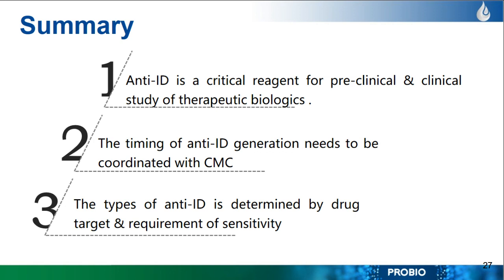To summarize, anti-idiotype is a critical reagent for preclinical and clinical studies for therapeutic biologics, and the timing of anti-idiotype generation needs to be coordinated with the CMC stage, and the type of anti-idiotype is determined by the drug targets and the requirement of sensitivity.